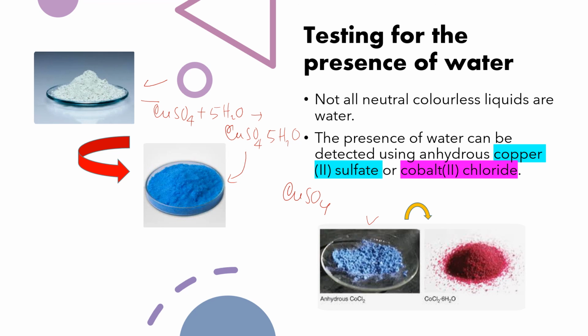When we use cobalt(II) chloride, after absorbing water it will turn from blue to red.